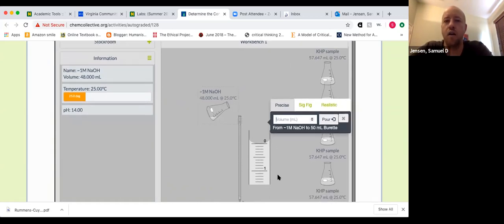This is important here, and this is something I would highlight in the lab. A burette is 50 milliliters, but you read the volume that is there. So when this is full, the initial volume is not 50 milliliters. Do you see a 50 right here? You wouldn't. The initial volume, where the bottom of the meniscus is, is 0. And it's not just 0, it is 0.00.